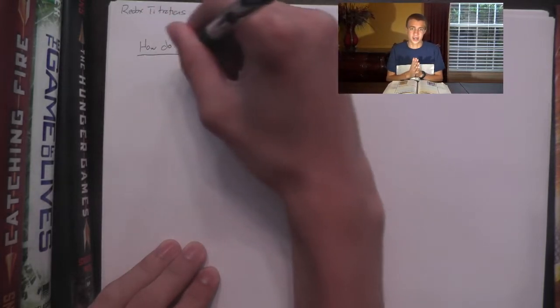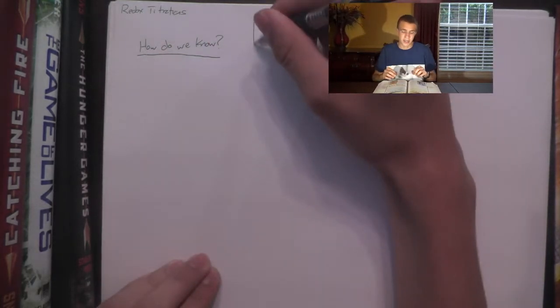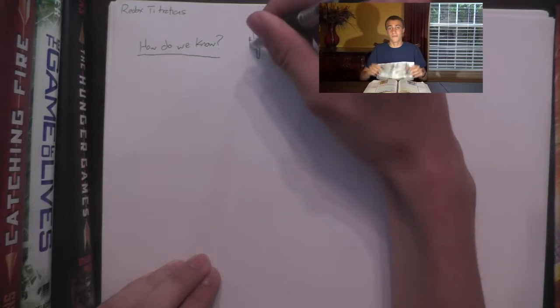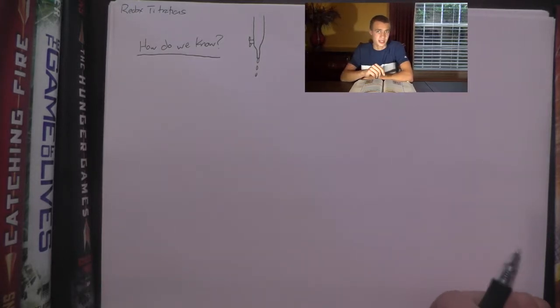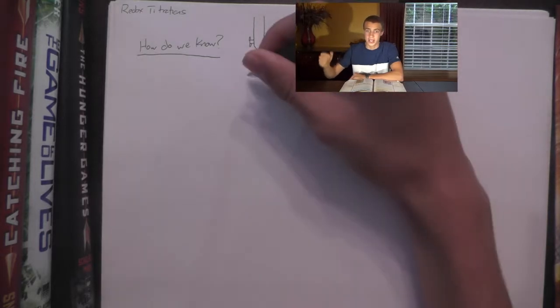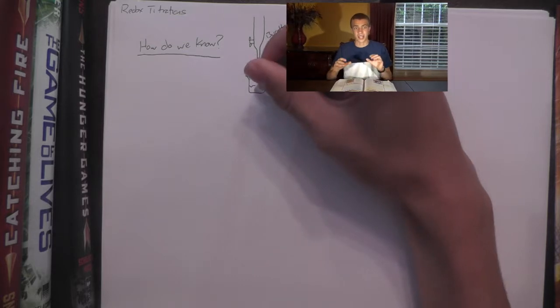So we're going to take our skills we've learned from titrations in the acids and bases video, and we're going to apply them to redox titrations. So first things first, what's the same in a redox titration? Well, number one, you're still going to be using your same good old burette. You take your burette and you drop a certain amount of a solution into the other solution that you want to measure, and you're going to be measuring for a reaction.